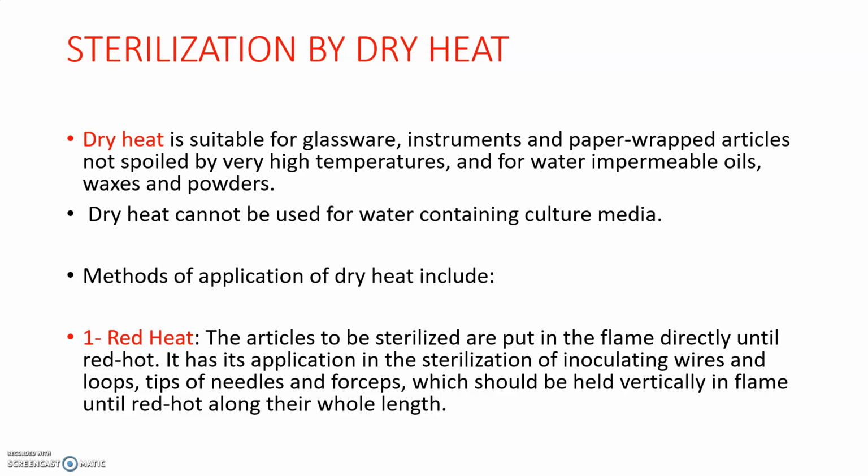The dry heat is suitable for glassware, instruments and paper wrapped articles not spoiled by very high temperature. So we can apply this dry heat method to materials which do not get spoiled as a result of exposure to high temperature. We can also use it for materials which are water impermeable: oils, waxes and powders. This dry heat method cannot be used for water containing culture media.